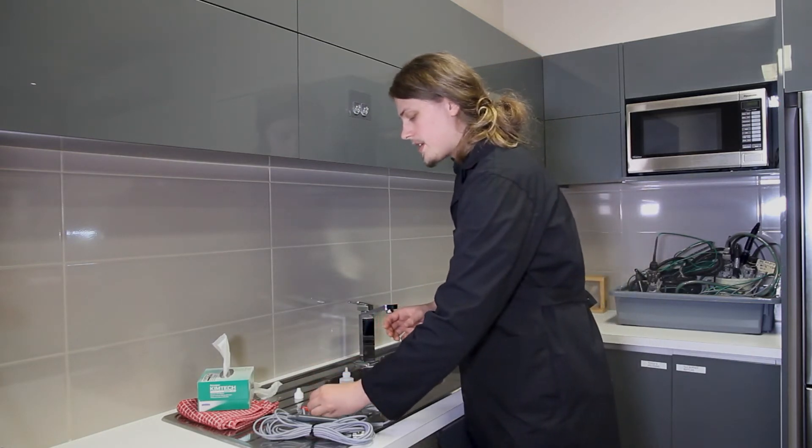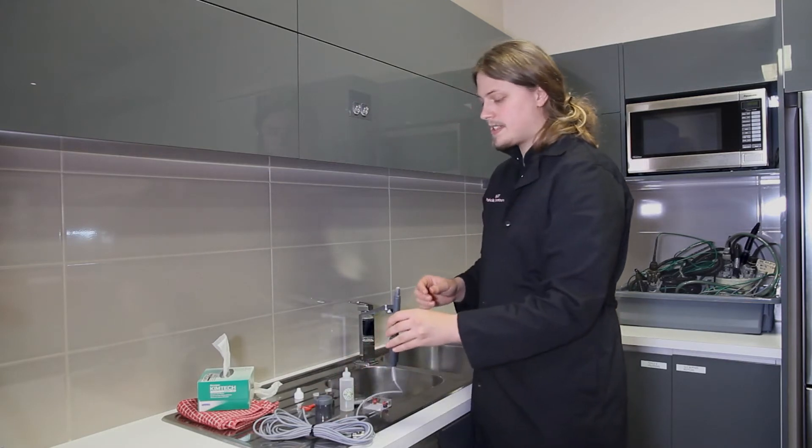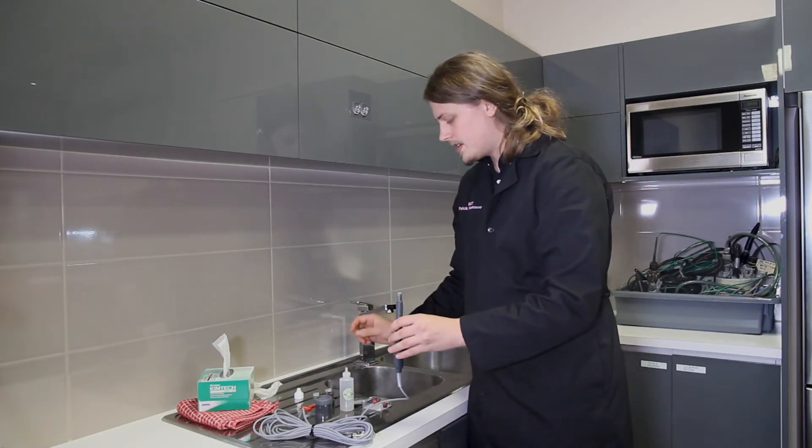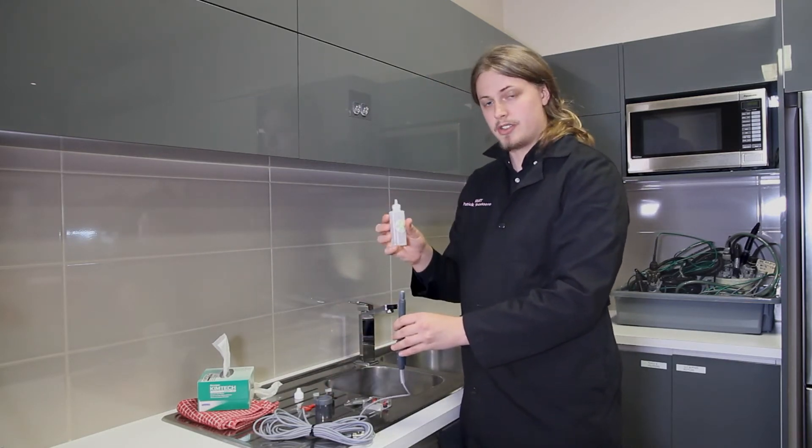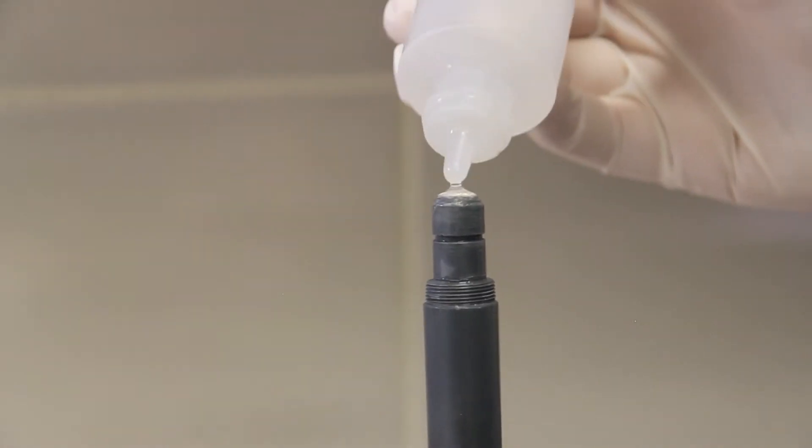Next, take your sensor and hold it face up, straight up in the air. Then take your electrolyte solution and place a single drop on the very tip of the sensor.